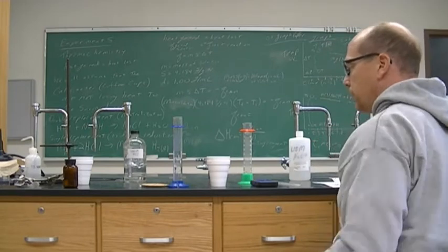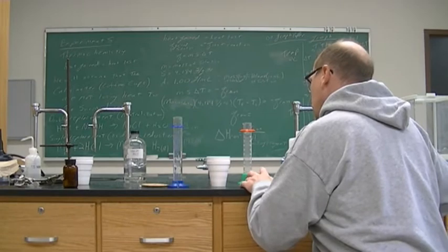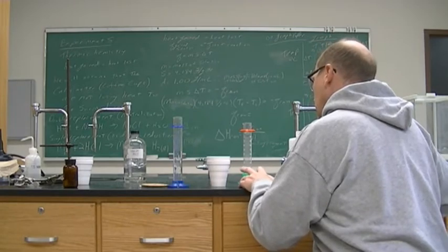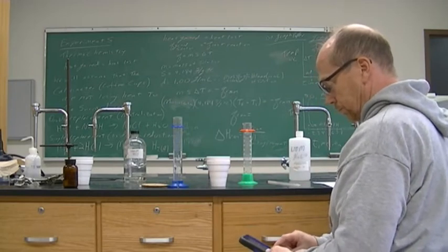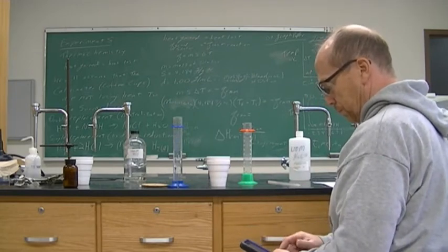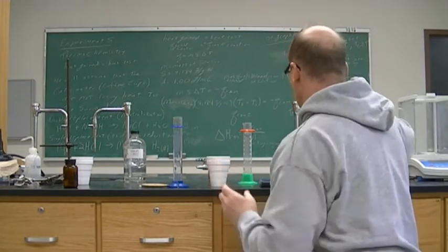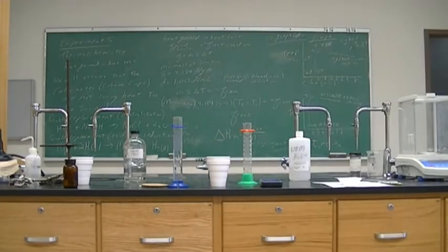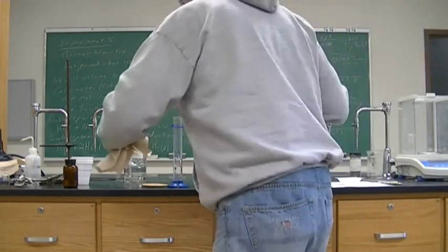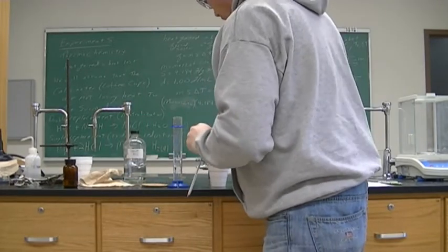All right, and so I'm going to reset my stopwatch. All right, and get ready for the next one. Rinse this off. Again, my starting temperature of the HCl is 19 degrees Celsius. So I add my magnesium.